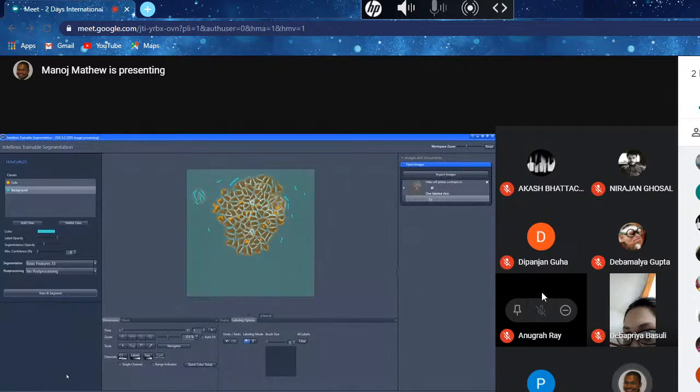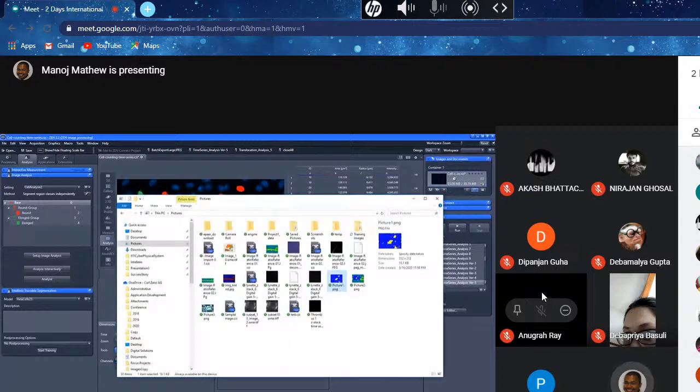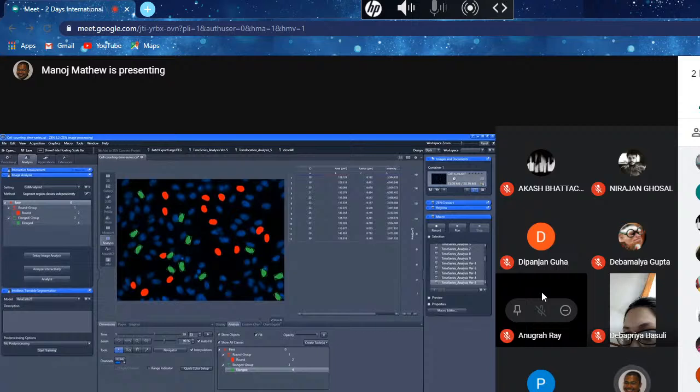In fact, if you want, you can keep training a little bit more, but again, keep labeling as minimal as you can. By the way, I had at my disposal more features if I wanted a more complex analysis with the algorithm, but I've chosen to keep it simple. I'm going to say finish. What I did now was just create the trained model, right? I've not really done image analysis. To do image analysis, let me pull that image into my workspace.